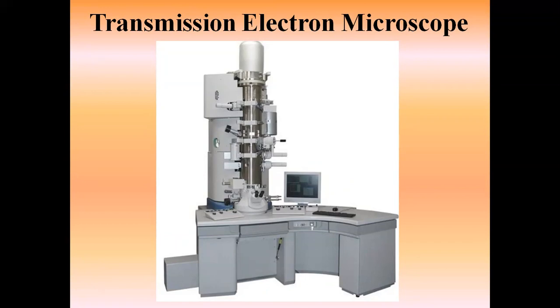But beyond that, if you need greater magnification and greater resolution, we place those samples in the electron microscopes. The advantage of the electron microscope is that it develops a high resolution and high magnification image. This is the actual setup, how the transmission electron microscope looks.